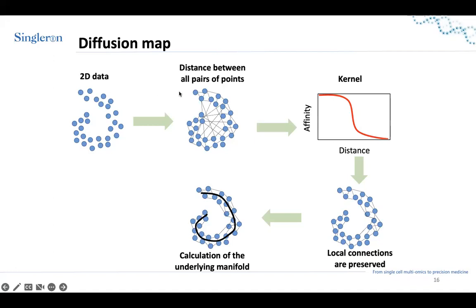So if you imagine a cell here, what is the probability of this cell going in this direction or this direction compared to going from here to there? Obviously, the cell has much higher probability to progress in the transcriptomic space, to differentiate, in the direction of its own neighborhood, right? So it makes sense to keep only distances that are shorter than a certain threshold.